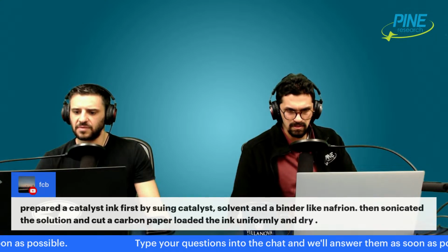All right, very good. Moving forward with some of the questions that are coming in. There's a question from Anindita. I'm trying to prepare a working electrode with Toray paper. Want to know how to prepare the electrode, drop casting the catalyst onto paper. And actually, FCB has described part of that. So FCB has given some answers here.